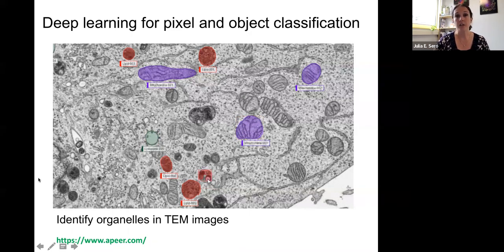It uses this black box of stuff happening in the background, rather than the human being trying to come up with some set of thresholds or features or parameters or bins that describe these different objects.